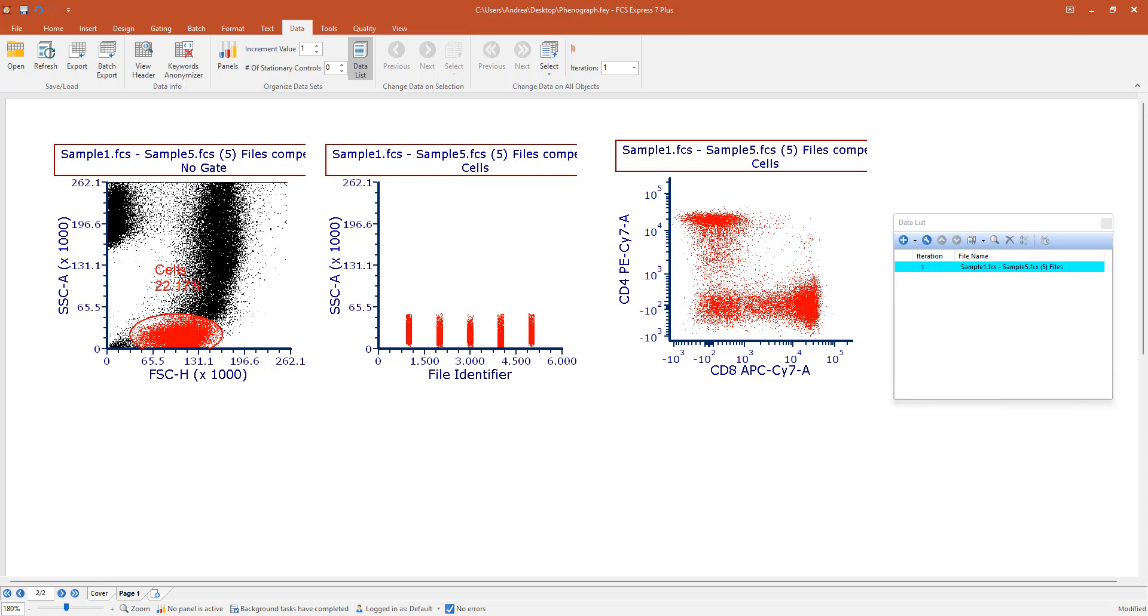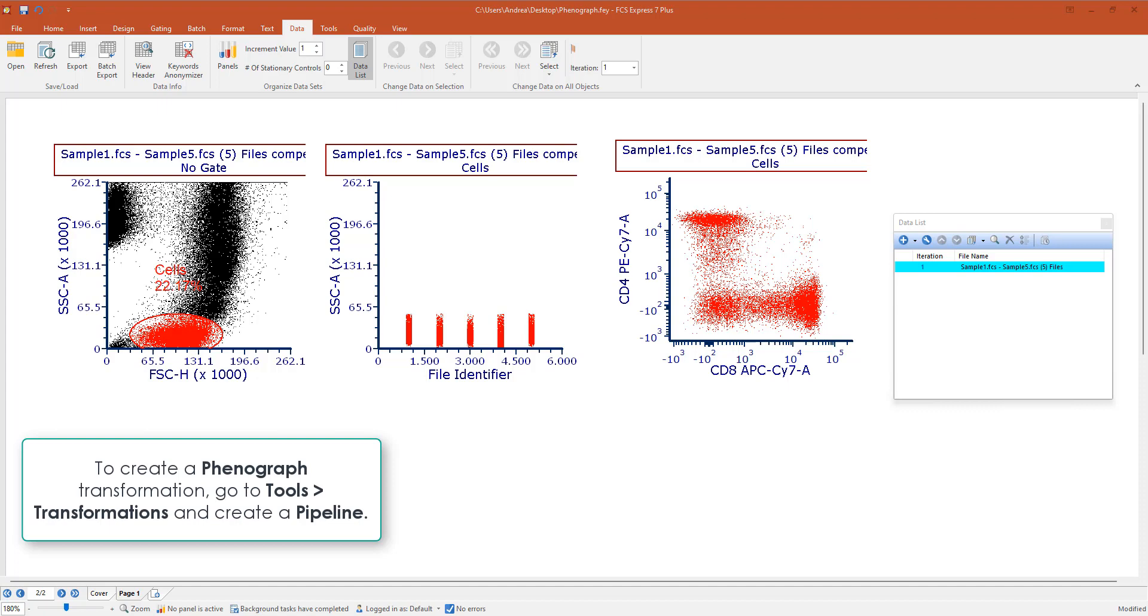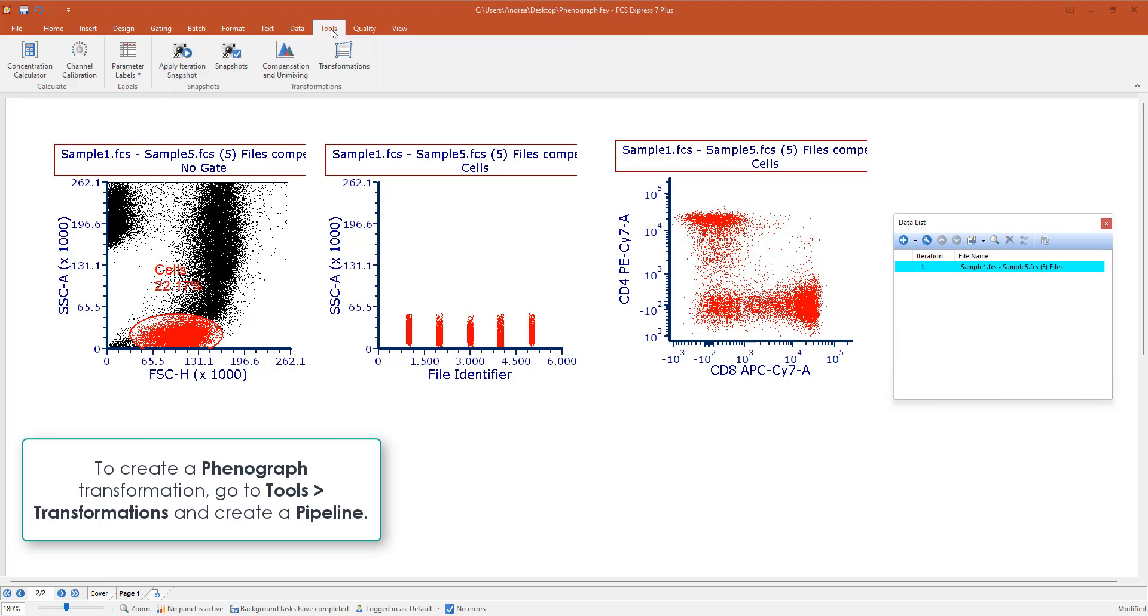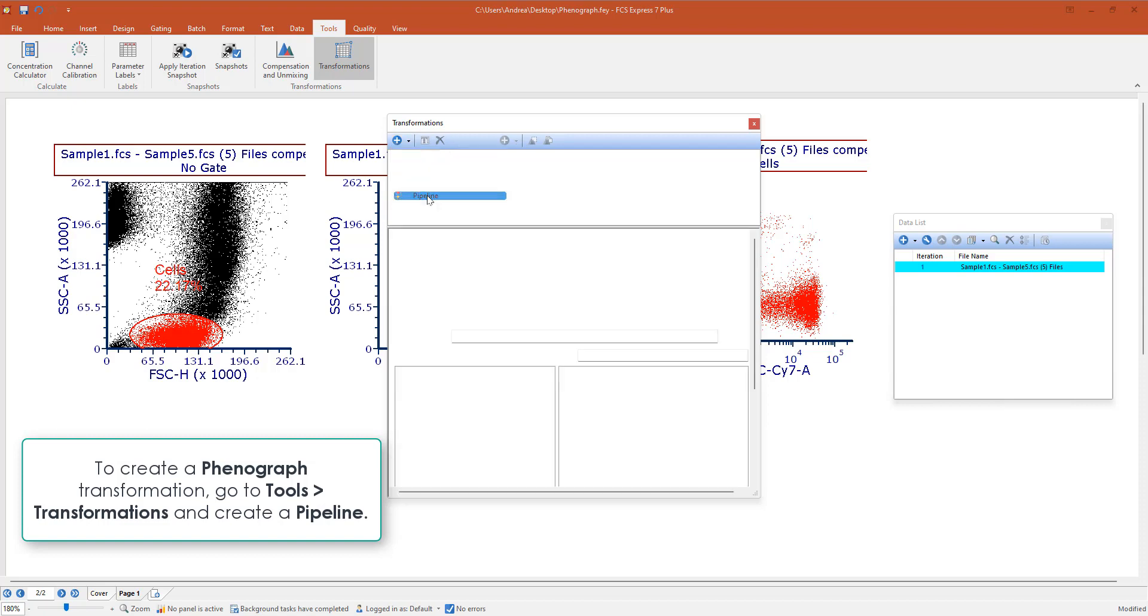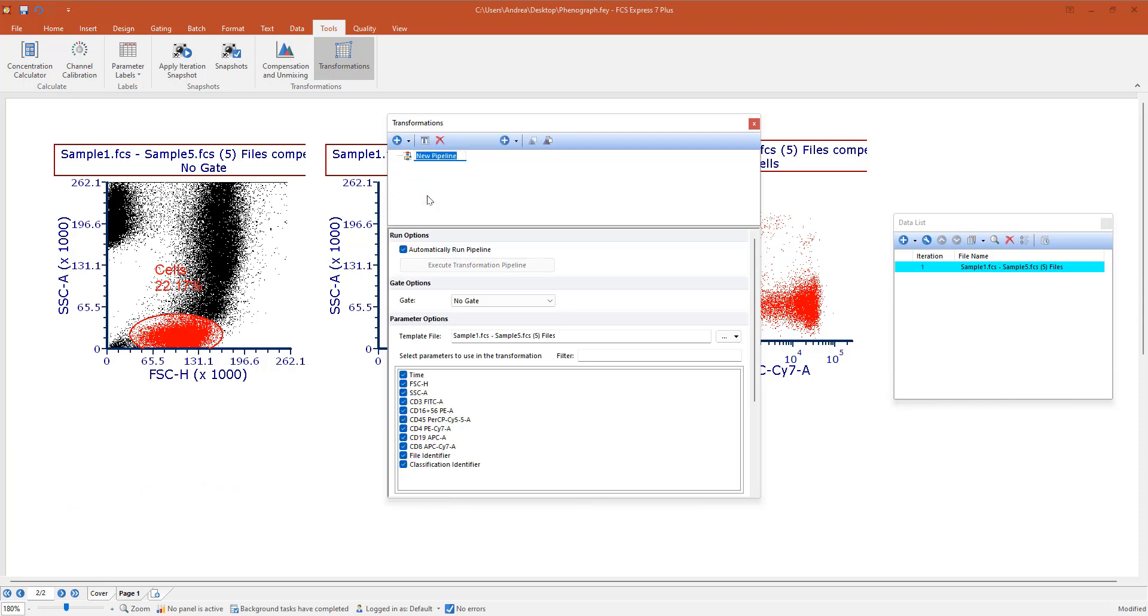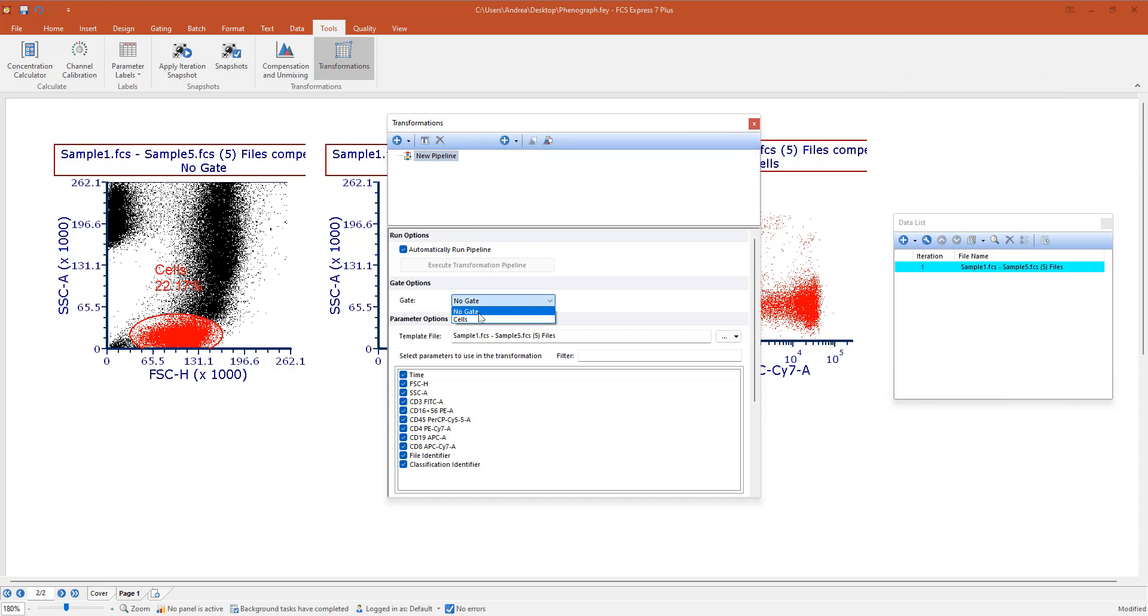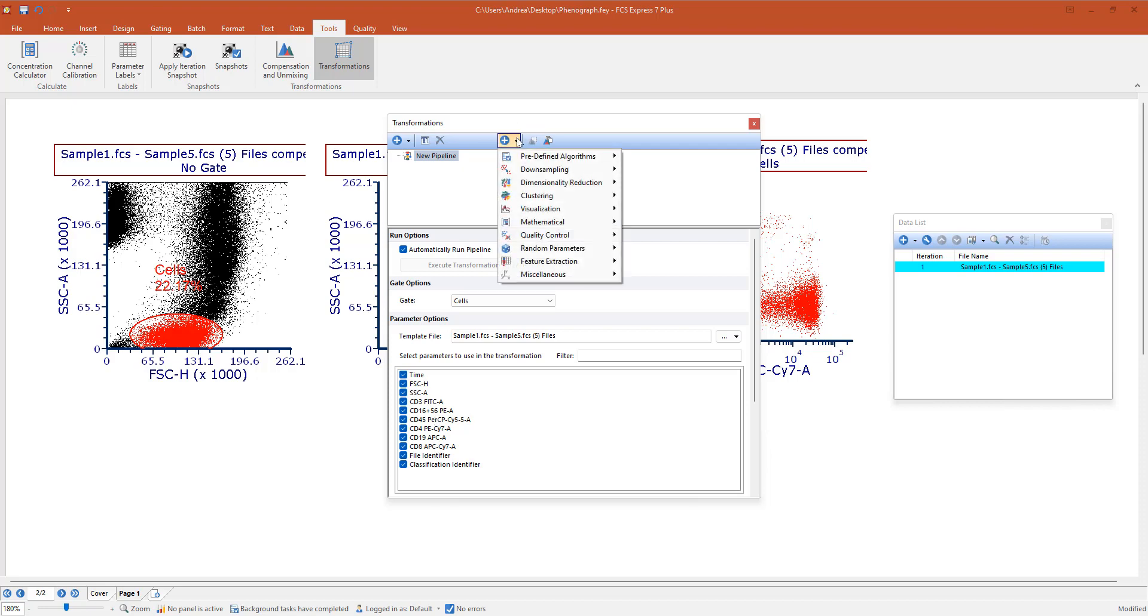When you want to start creating your Phenograph, simply go to tools, open the transformation dialog and create a pipeline. In this pipeline, you can select the input gate, select all the parameters of interest. Actually, I would suggest to select all of them every time. And then, from this little plus drop-down menu, you can start adding steps to the pipeline.